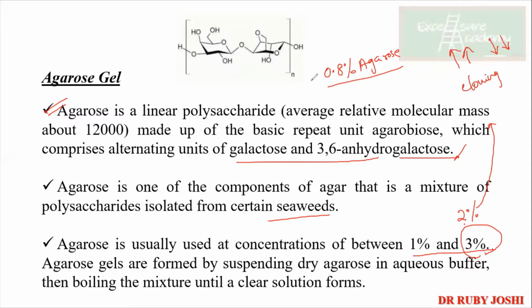Since you have got low concentration over here, the larger DNA, you just have to check whether the DNA you have isolated and purified is in the purified form or not. You just need to visualize, right? So हम क्या करेंगे? Lower concentration of agarose use करेंगे to see the large stretch of DNA fragments, whether it is present or not. Okay, so this is how it is being done.